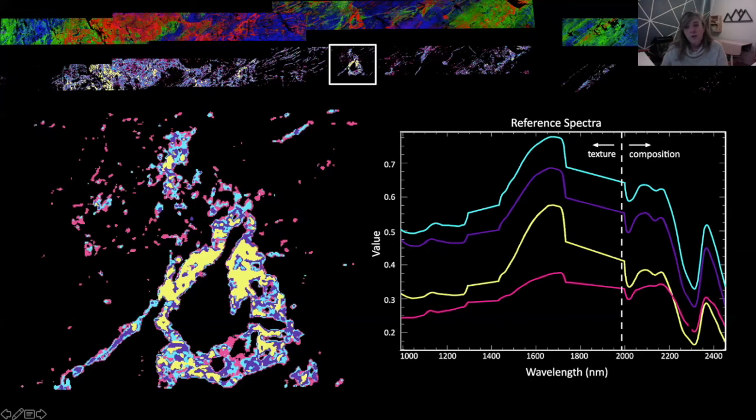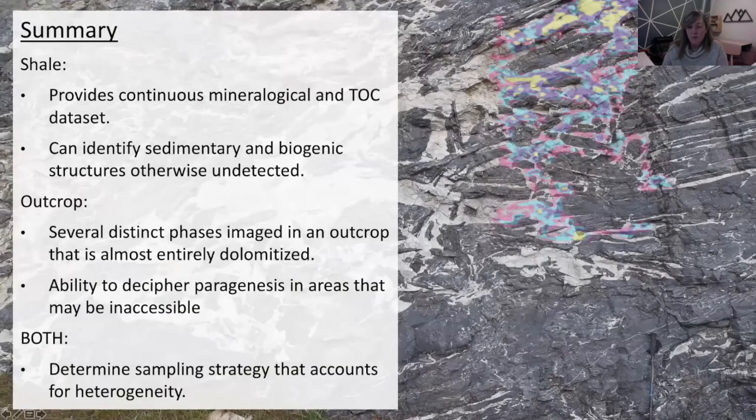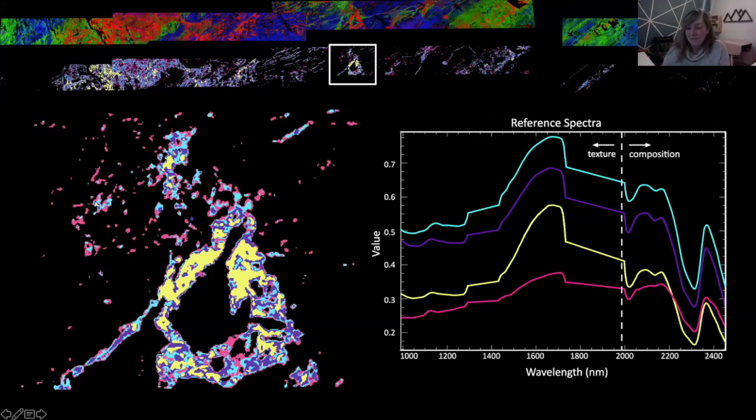Now, subsequent petrography has suggested that potentially these blue and purple phases could be grouped together. I apologize, I don't know why the timing is going.